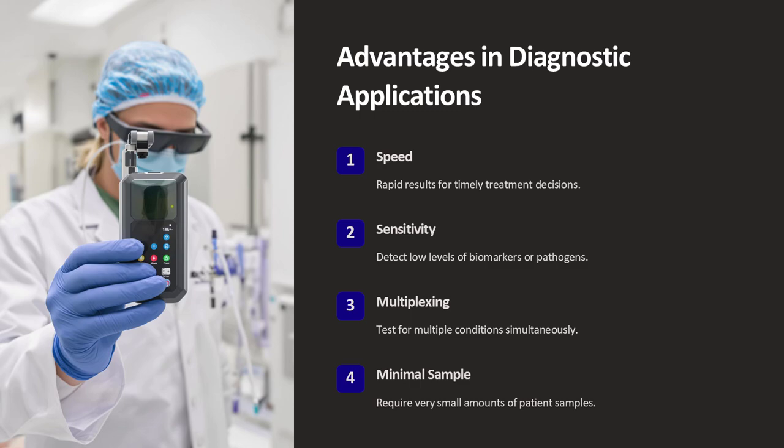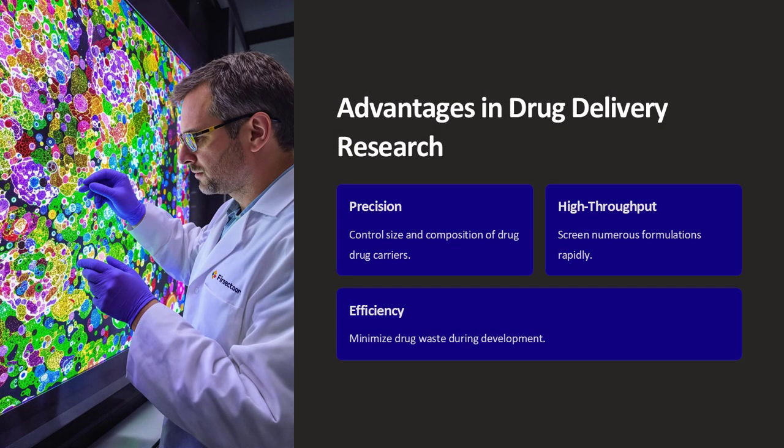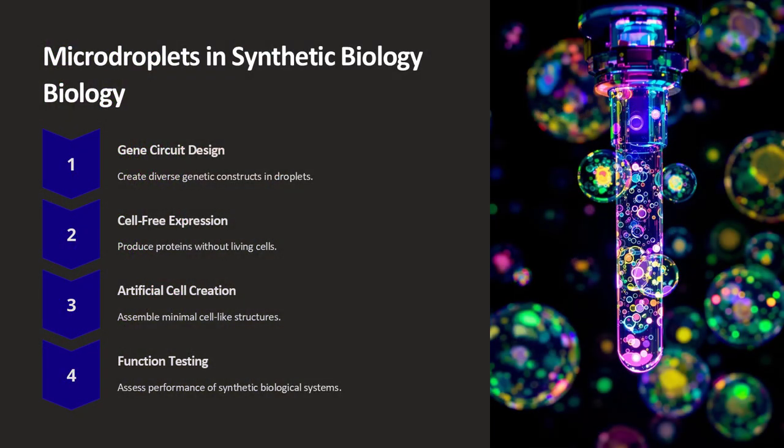Imagine having a supercomputer that can instantly read, compare, and catalog every book in our digital library analogy. This is essentially how data from microdroplet libraries are processed to identify the most promising compounds or materials. Furthermore, microdroplet libraries are not static. They can be dynamically manipulated to explore reaction kinetics and optimize reaction conditions in real time.